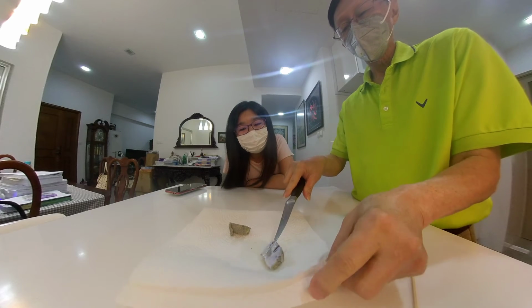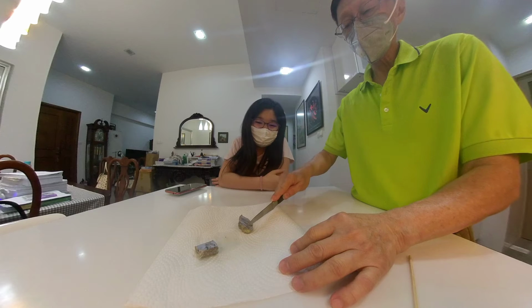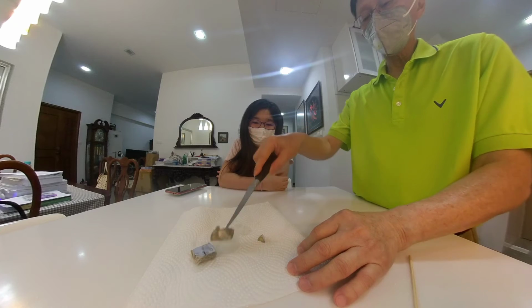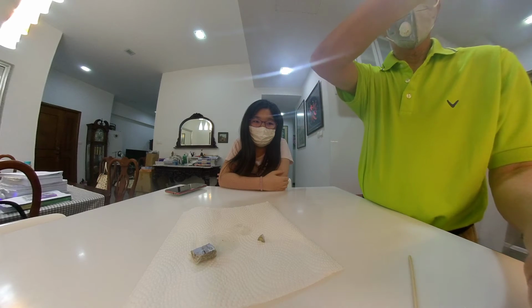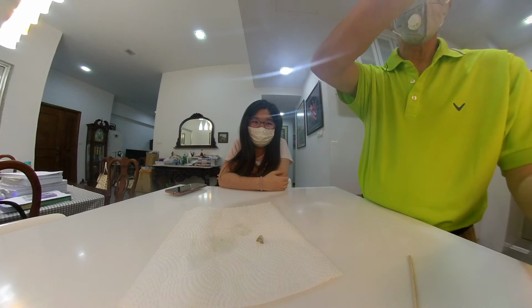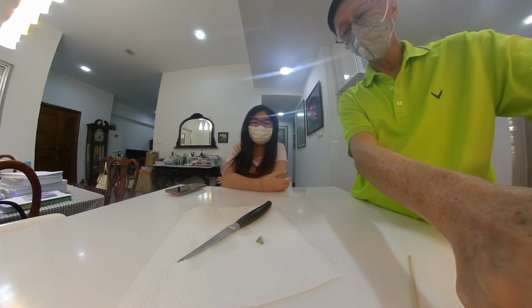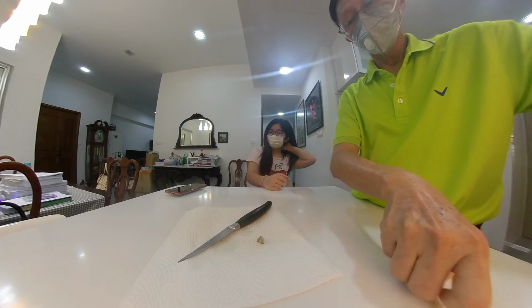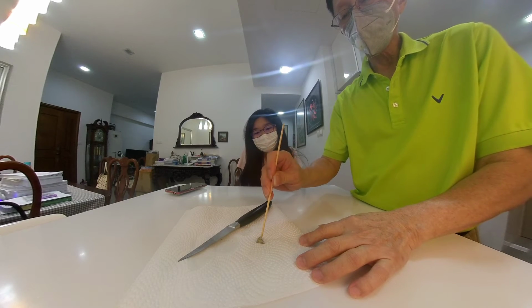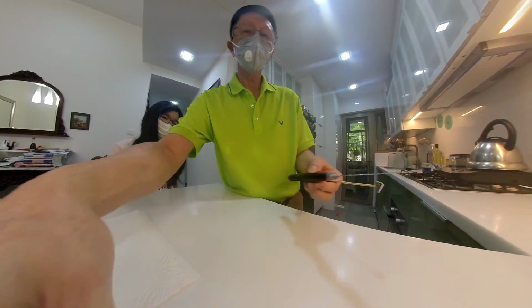Okay, now this is still a very big piece, so we're going to cut off a small piece like that. And that piece is not small, but because we are using a basin, it is okay. Okay. So we are going to bring this near and put it into a basin of water. Okay?